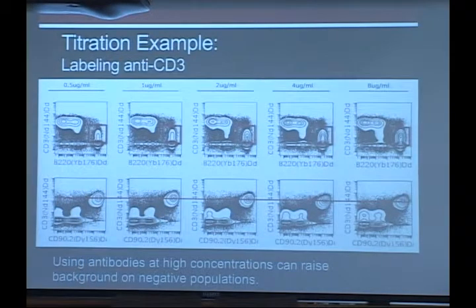So this is exactly what you would expect if you're saturating the primary target. But it's important, I think, as an example of why adding more antibody isn't always a good thing. You want to really optimize your signal to noise and make sure that you're staining things at a saturated but not oversaturated concentration.